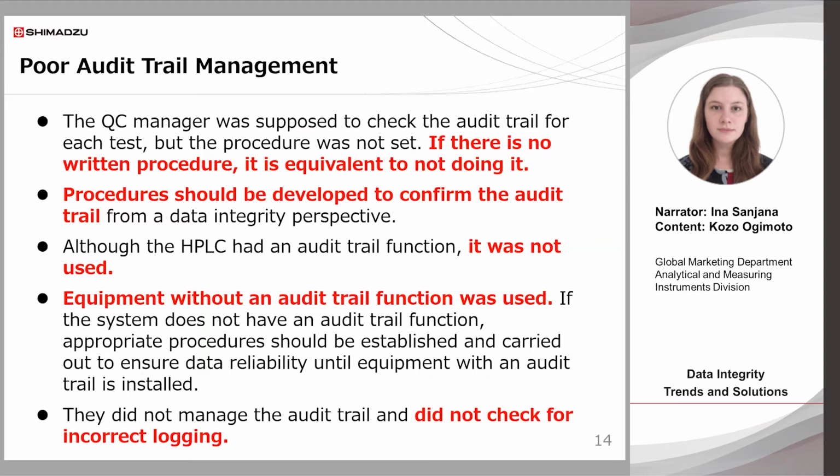As mentioned previously, some instruments have an automatic audit trail function, but in one case it was pointed out that this function was not used even though it was available. If equipment without an audit trail function is used, other procedures should be established to maintain an audit trail and preserve data reliability until such time as equipment with this function can be installed. Finally, in the last case, it was pointed out that the audit trail was not managed correctly. As we can see, careful management and review of the audit trail is required.